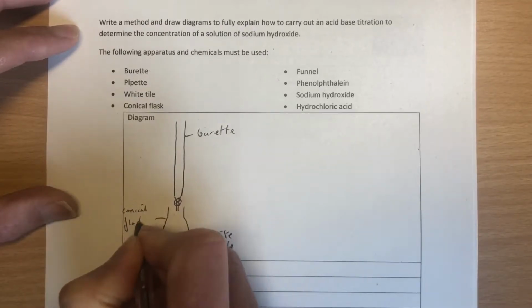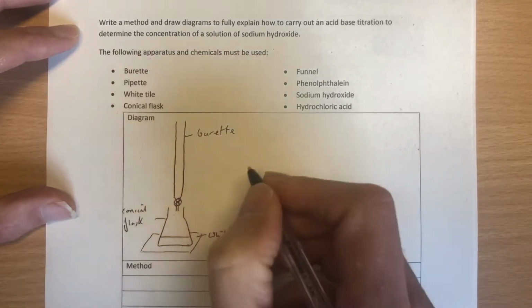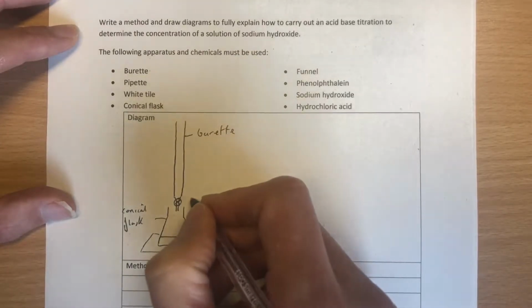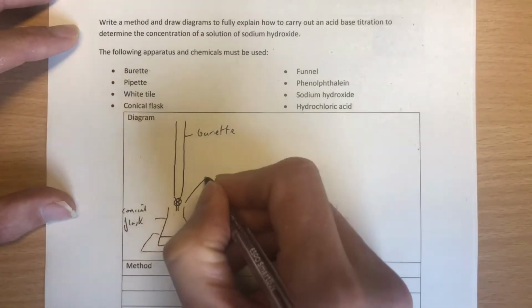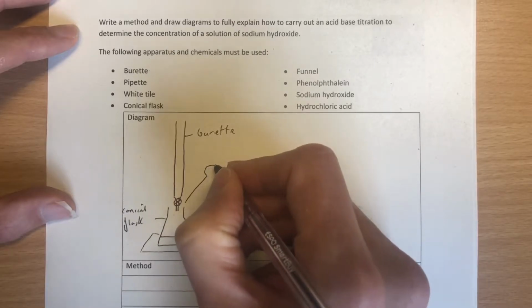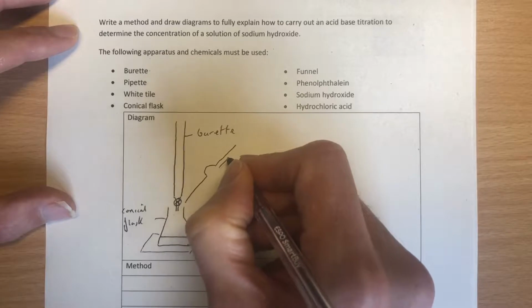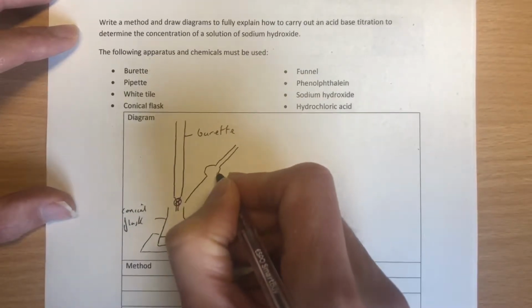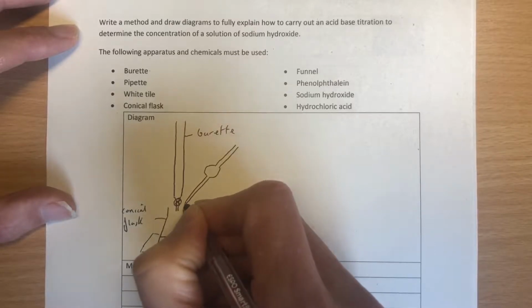Now we are going to put the alkali into there with a pipette. So we will measure our alkali out into the pipette. The pipette is a thinner tube even than the burette. It has a little bulb in the middle, so we can get the required amount of sodium hydroxide into there. Very thin, little glass. These are all glass, very fragile. And there's our pipette.